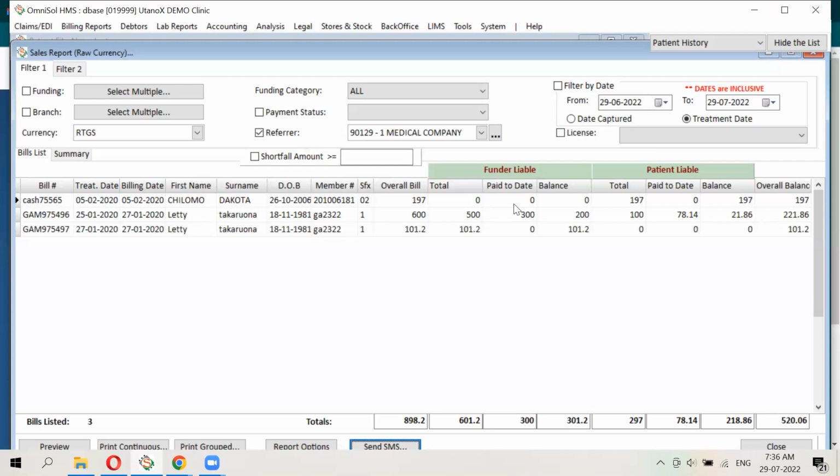So okay, that's all right. Maybe you can send me the questionnaire, and then I'll do that. And then when we meet next, we can go to the nitty-gritty and go through the whole process of registering a patient. So that as we do that, at least I can pick where I need attention or where I need answers on how it can be done, so that we know the whole process from start to finish.